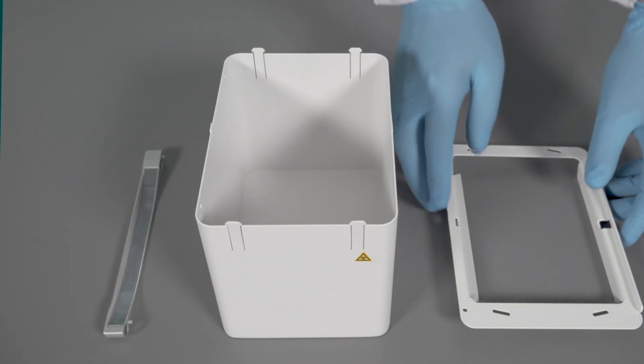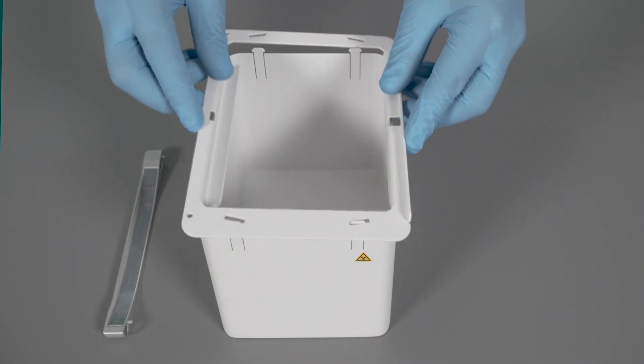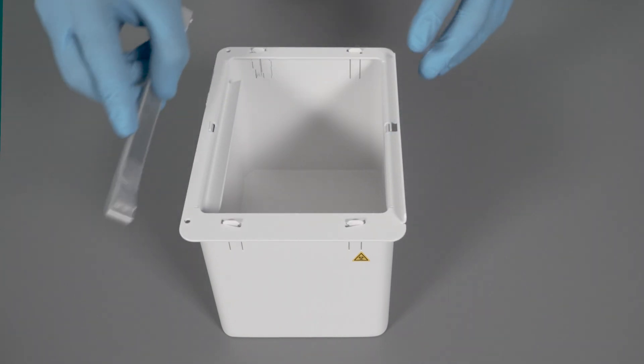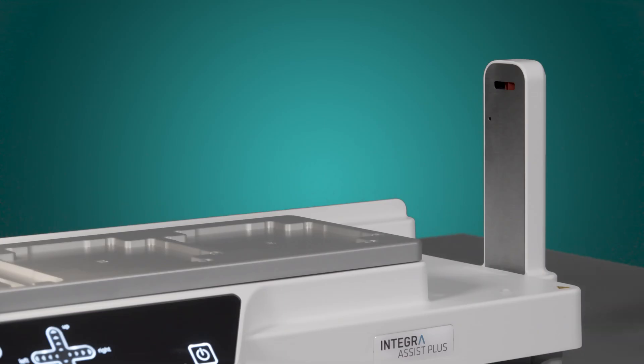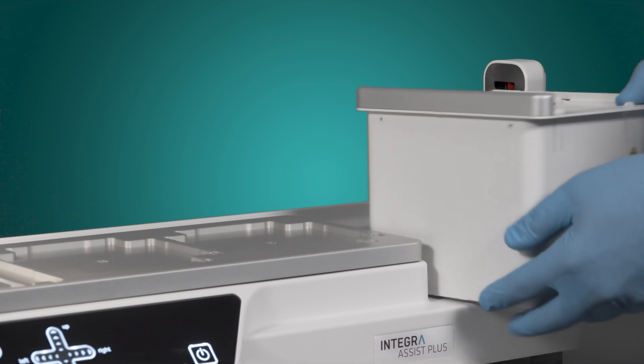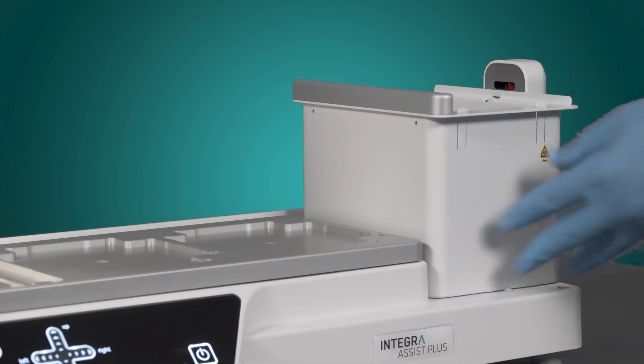Finally, assemble the waste of the Assist Plus. Therefore, take the waste bin, mount the frame and the sensor reflector on top. Place the waste bin on the right side of the Assist Plus with the ejector latch and the sensor reflector facing the tip sensor on the right side.